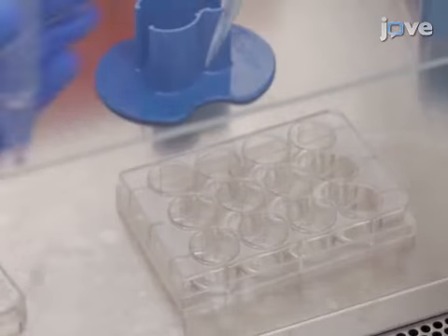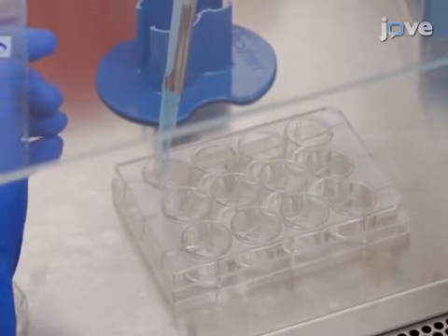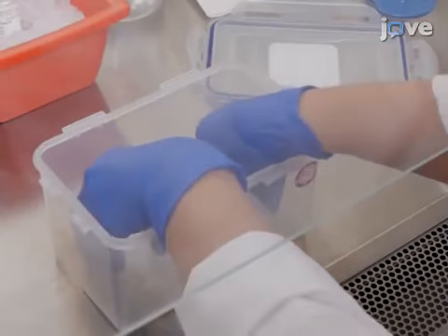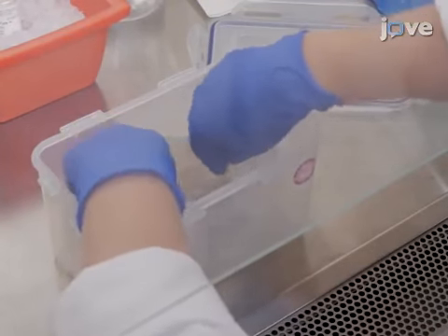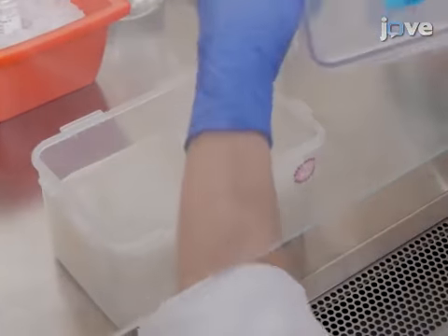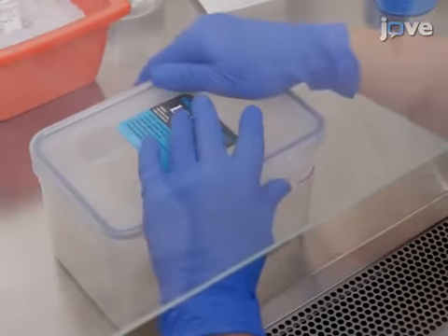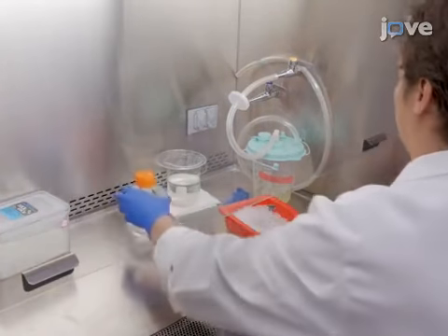Add 250 microliters of collagen 4 solution to the wells of 12-well glass bottom plates and place them into an appropriately sized, tight-closing plastic box. Place wet paper towel over and around the plates to manufacture a humid chamber and close the box. Then, incubate the plates overnight at room temperature.